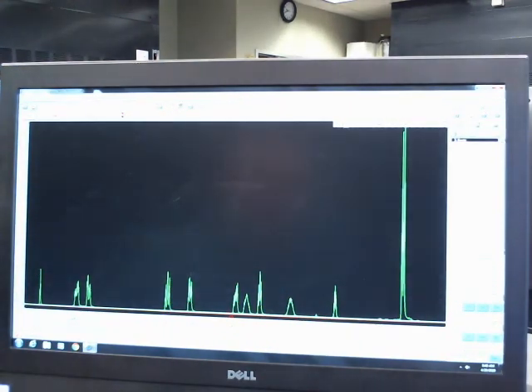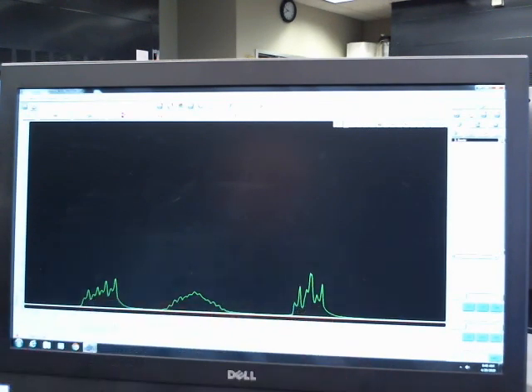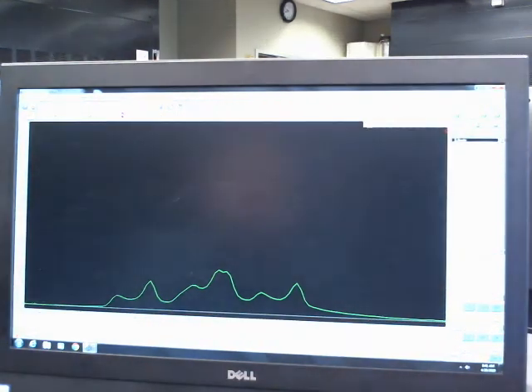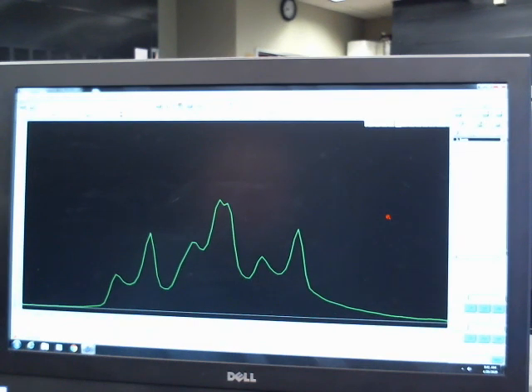So what we need to look at really is just A and B and measure the J's. I'm going to expand just B for right now, and we'll make that a little bigger. Okay, and so what we want to measure is this J, and this J. Those are the two J's, and you know that from when we did the reduction and looked at it.